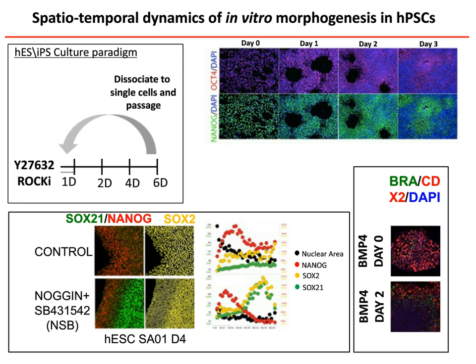The scatter plot in the center, showing each of these transcription factors as a different color, makes it completely clear that there's a significant elevation of SOX2 and SOX21 below when cells are treated with proneural factors, and that's not true in the control. So this is how we are quantifying these types of results.